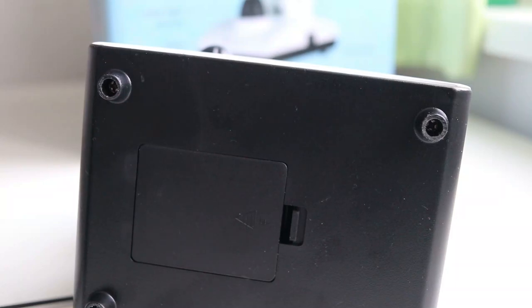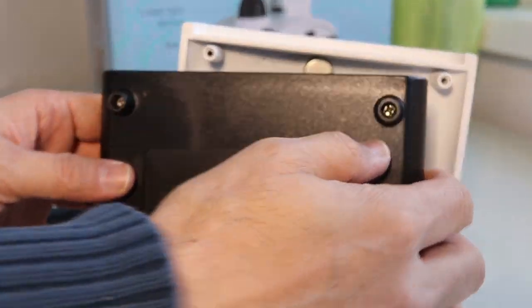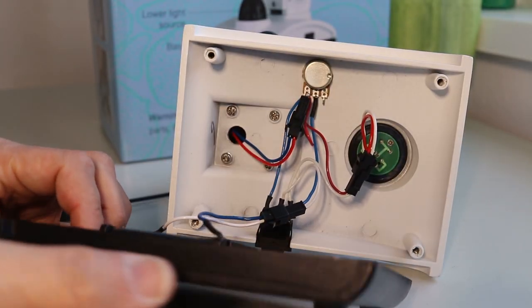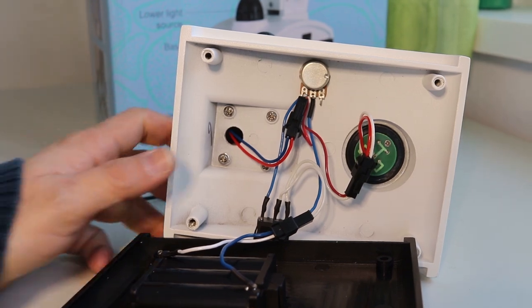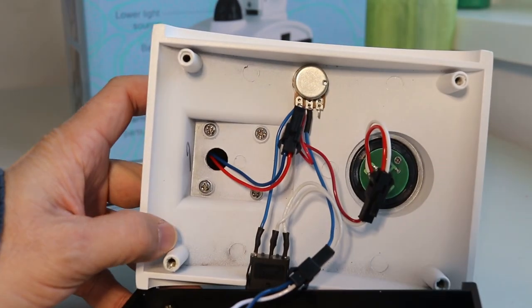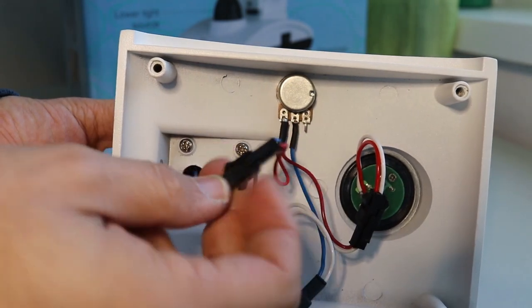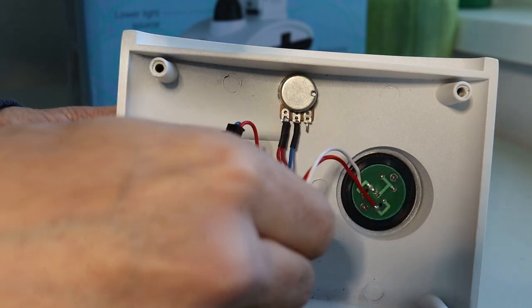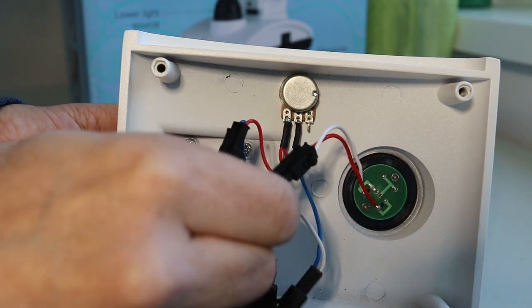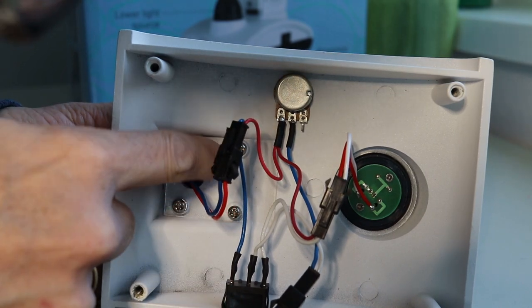Okay, now let's open up the base and have a look inside, because sometimes the inside reveals something about the quality of the device. And it looks quite neat and orderly. All of the relevant cables are put together over connectors. It does seem to be quite okay. In that sense, I'm a little bit relieved. The company seems to be quality conscious. They could have simply soldered everything together in a wild way.